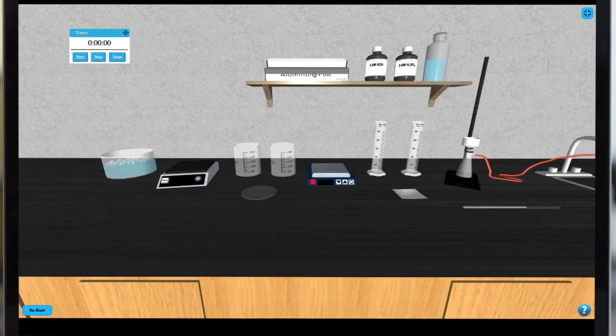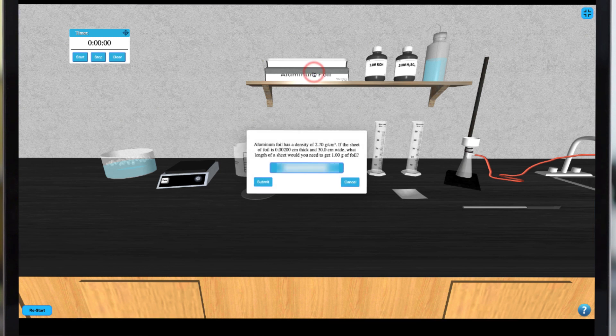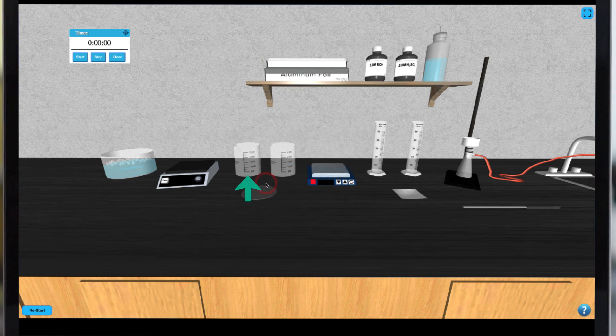To begin our synthesis experiment we can obtain aluminum from our foil by clicking on it and choosing a length that will give us one gram of aluminum. This will place the aluminum in the left beaker.